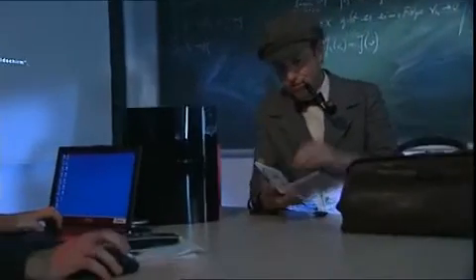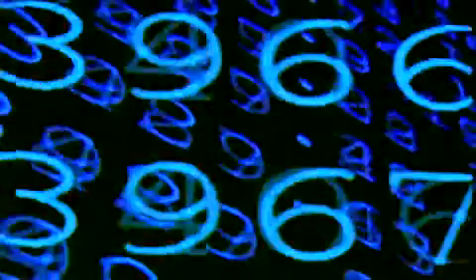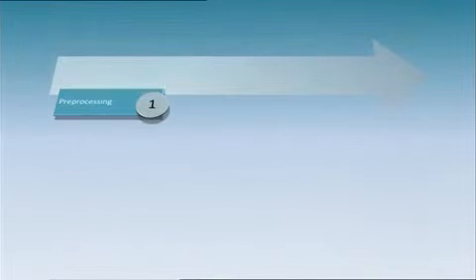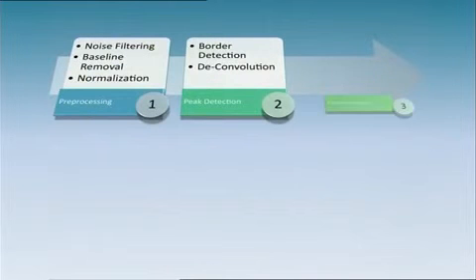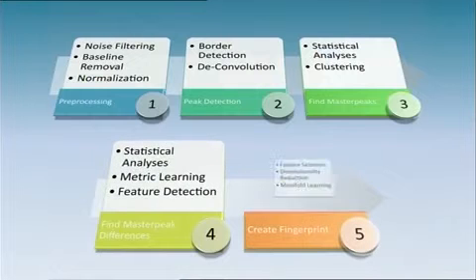This data is now being analyzed by Dr. Tim Conrad, scientist at the Mathematics Institute of Freie Universität Berlin and at Matheon. Which analysis methods are needed? How can one speed up the investigation? An analysis pipeline with a sequence of new algorithms is key to a successful investigation.